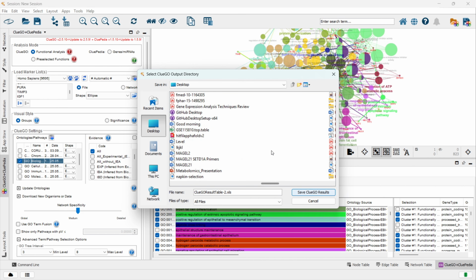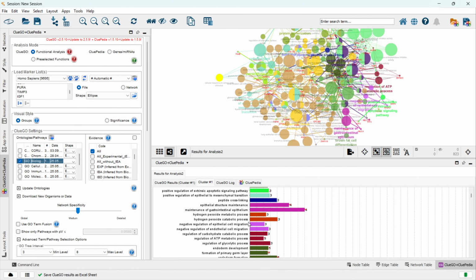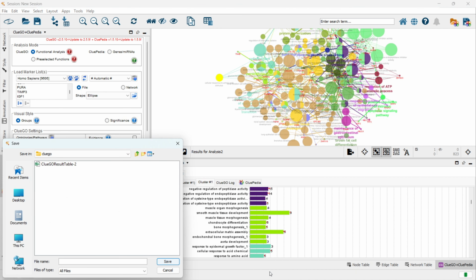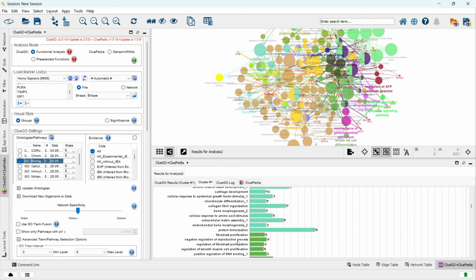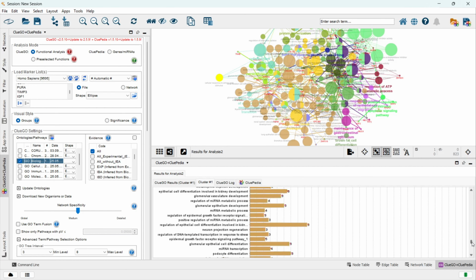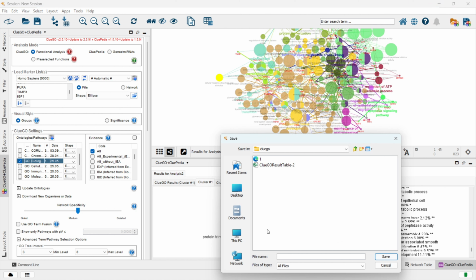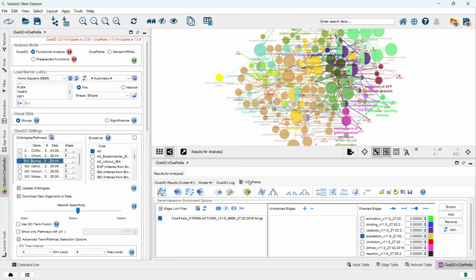Additionally, if you click on this cluster 1, you will see graphs like bar graphs and pie charts, which will help us to summarize the data visually. So this visualization also you can export as a high resolution SVG image for your presentation or for your report. Okay. Similarly, we'll repeat the analysis for the cellular component, molecular function, and KEGG pathways. I will speed up the process 2x for the remaining steps, but I will export all the results into a table for further analysis.